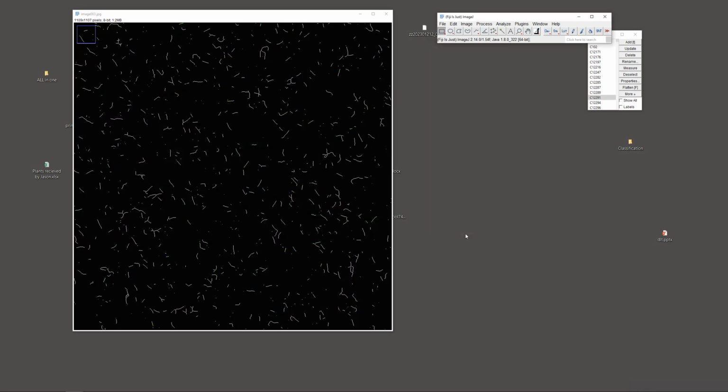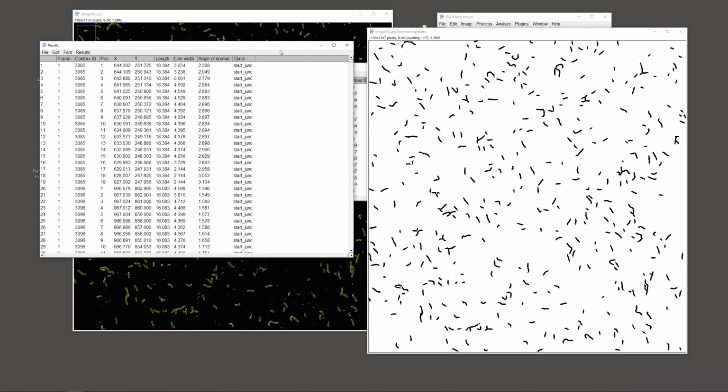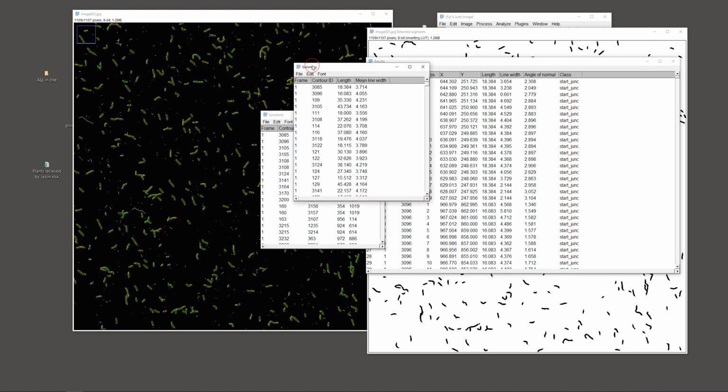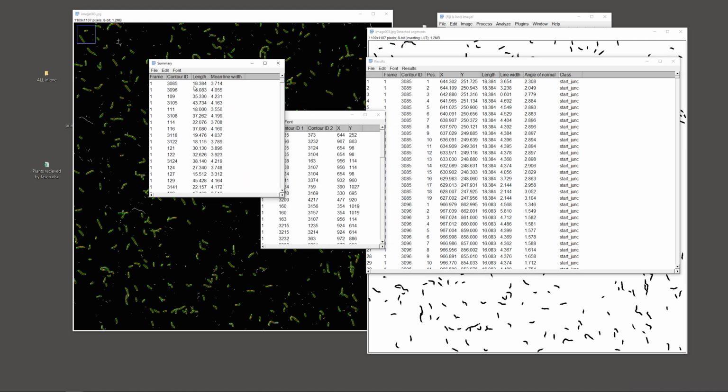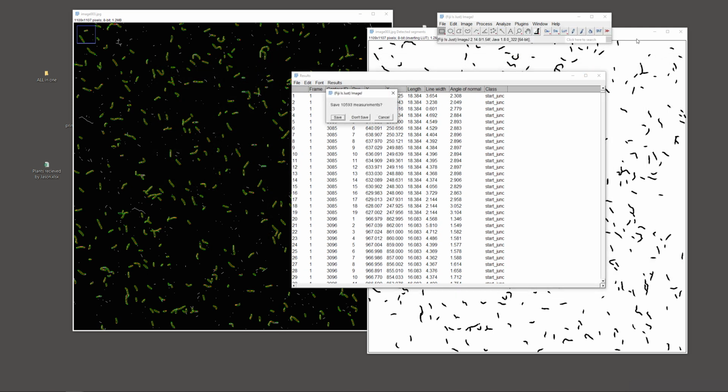So if I click OK, you will again have all the lengths. It depends on how you do the data cleaning first, which objects you don't want to select and which ones you want to select. If you go into the summary option again, you will see the length really nicely and precisely. And this time you will see that you have less noise, as it was skeletonized already.